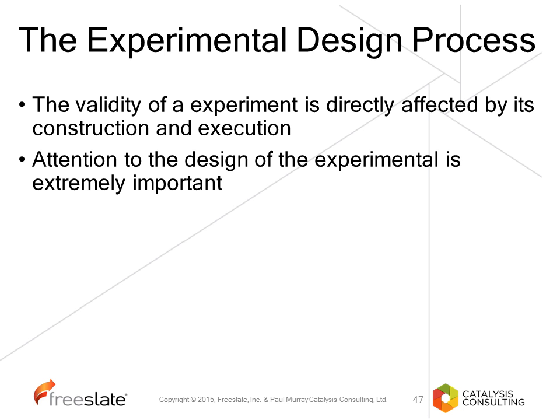If you carry out 20 experiments over the course of a week, and you use up all of your starting material, and you're no further forward, then you have wasted a lot more. It's a lot harder to recover from that position, and it can be very expensive and a significant waste of time.